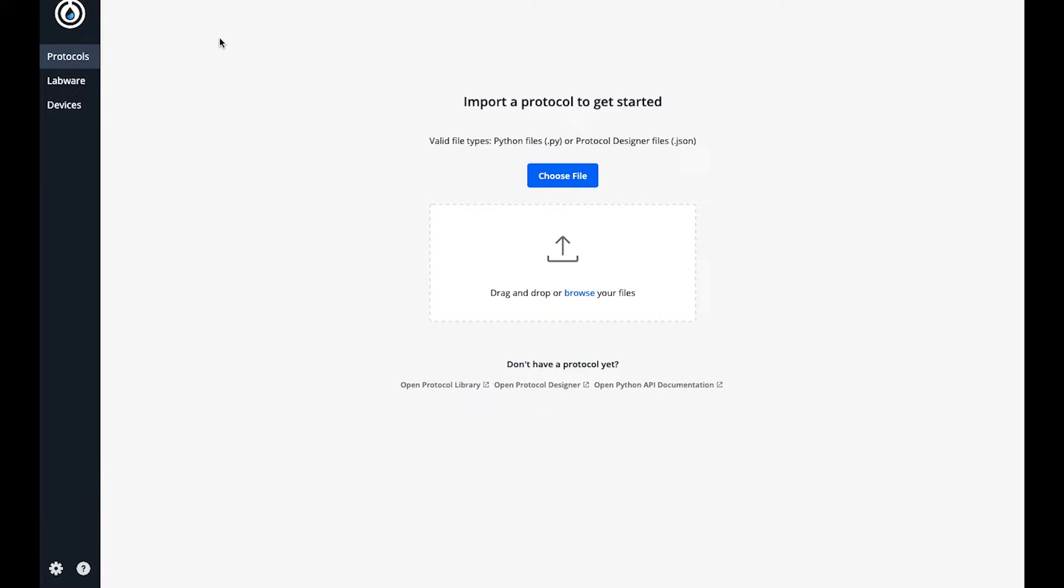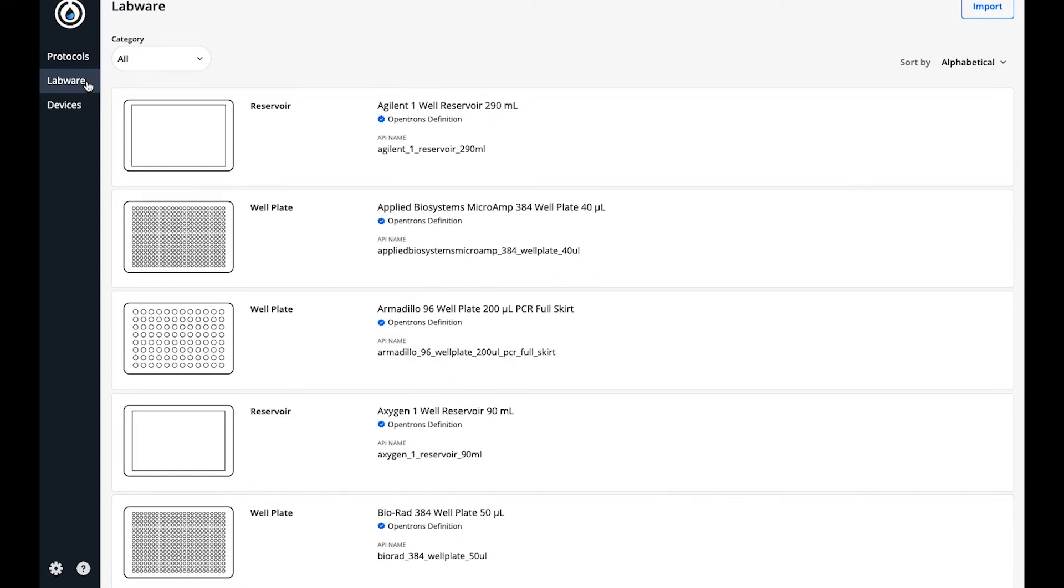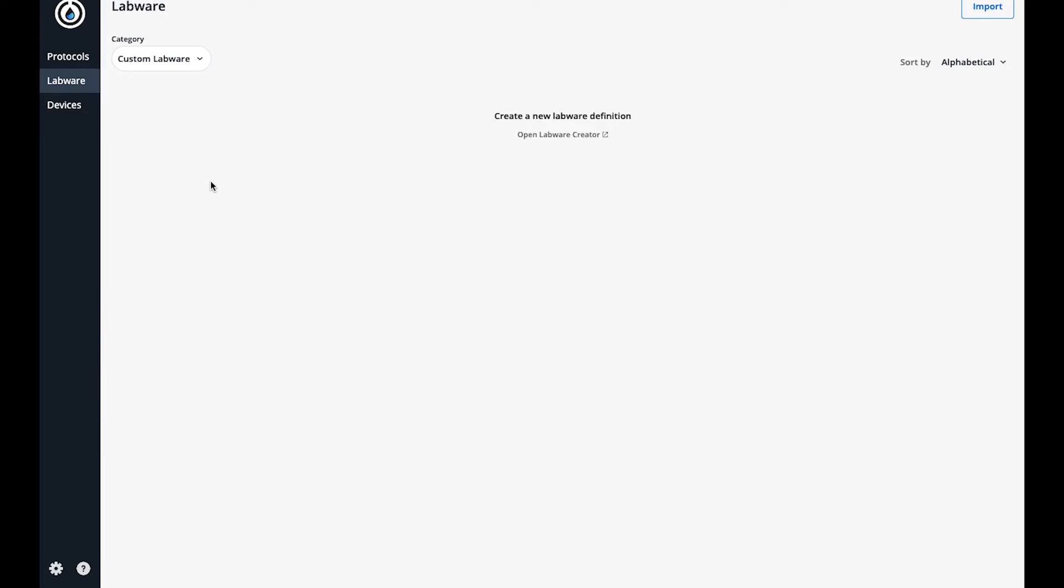I will be brought to the protocol tab when I first open the app. This page shows all the protocols I have uploaded to the app. I have none because I just installed the app. I also have the labware tab which shows our standard labware as well as any custom labware I have uploaded.